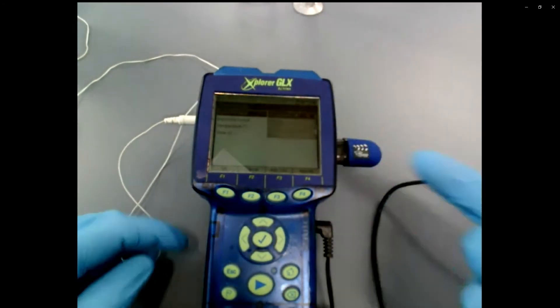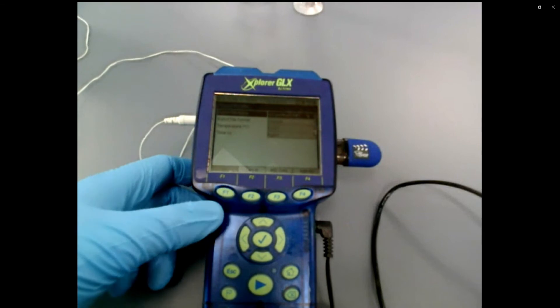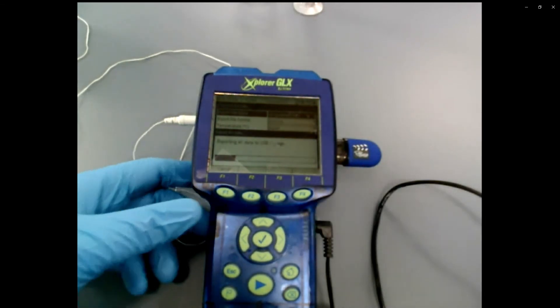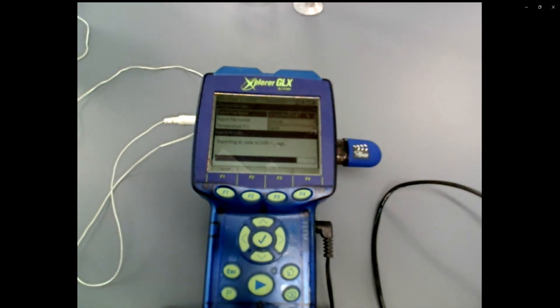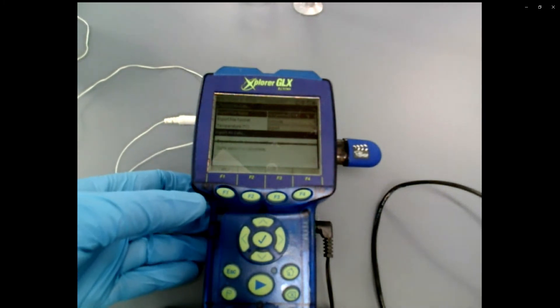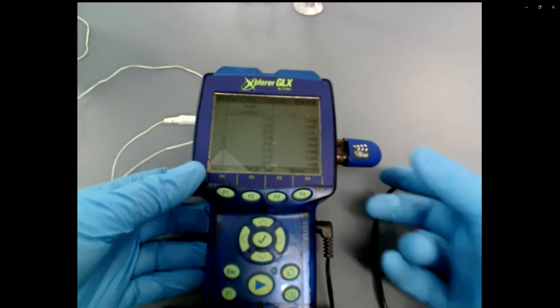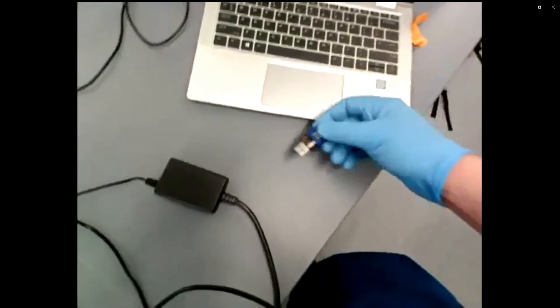And so I'm going to select that. Then it's going to show a window. I'm just going to hit OK. So it's going to say exporting data to the USB thing. This takes sometimes a fraction of a second, sometimes 30 seconds. But once the data is exported, it will say it's complete and then you just hit OK. Now, you guys in lab will have to do this for all of the runs you collect. I just did this one run. So we take this out and slap it into our computer, take the data off the file.